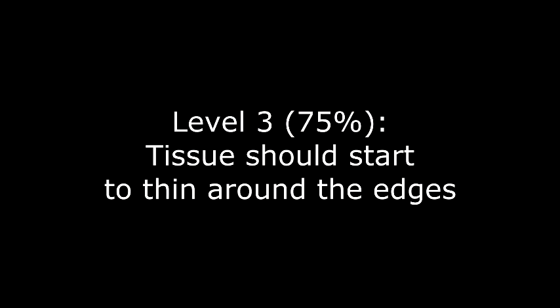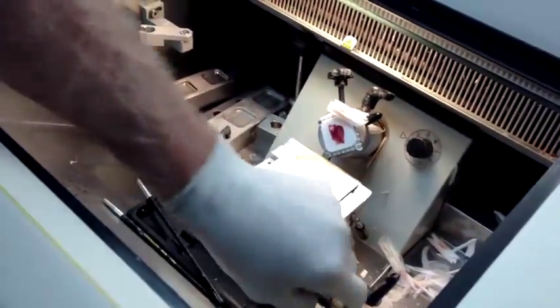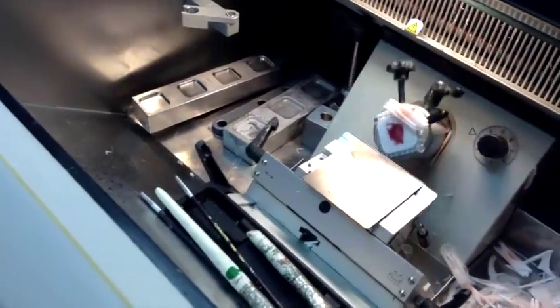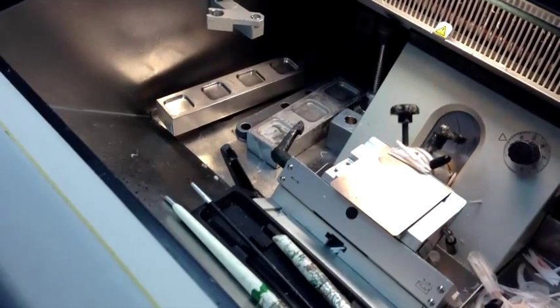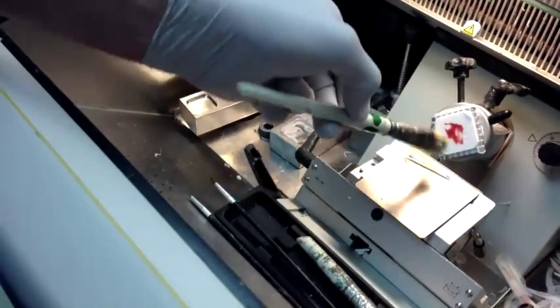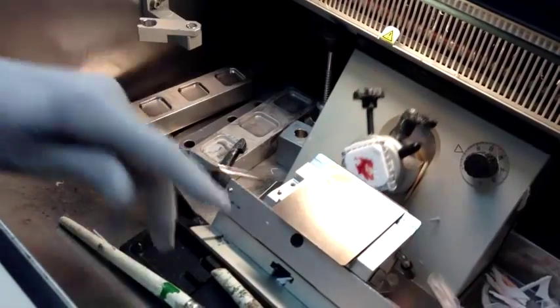So I'm going to take my next section here, and now we're going to get to the exhaust level. I'm going to course-advance this thing, keep it clean so that I can see how far I appear to be going in. We're starting to get close, and I'm going to say this is about 90% of the way in. You can see that the specimen is starting to disappear compared to the size of the tissue that we had before. I'm going to call this our exhaust level.